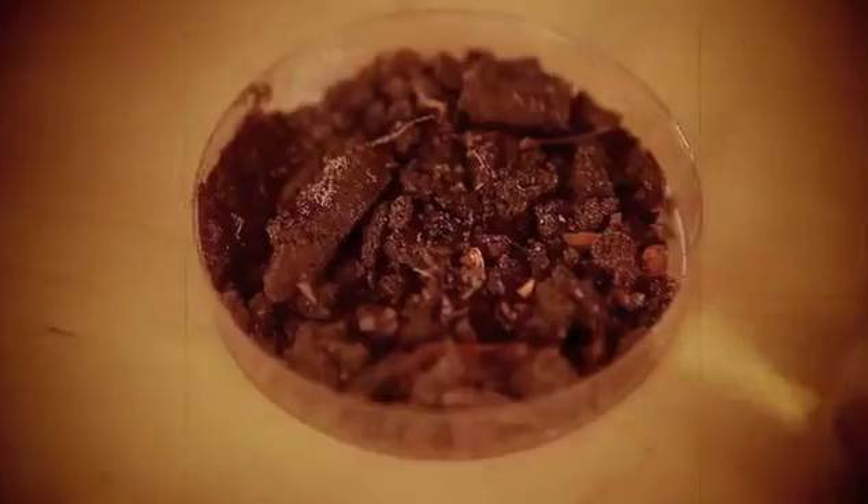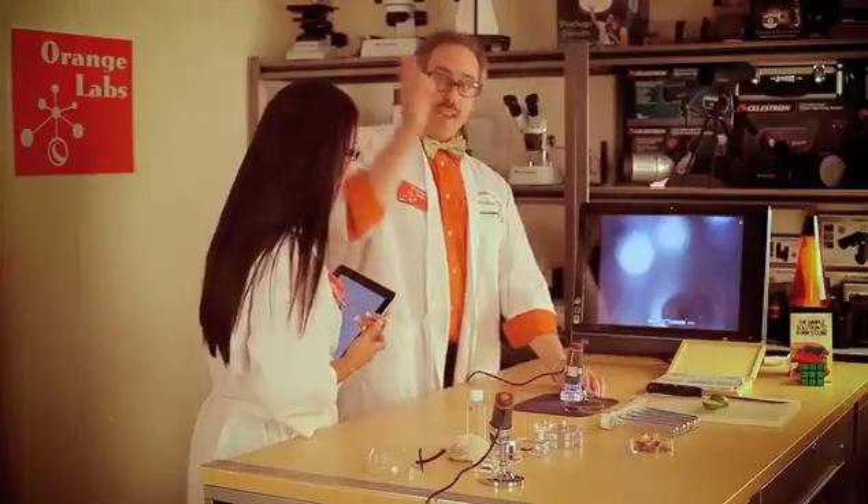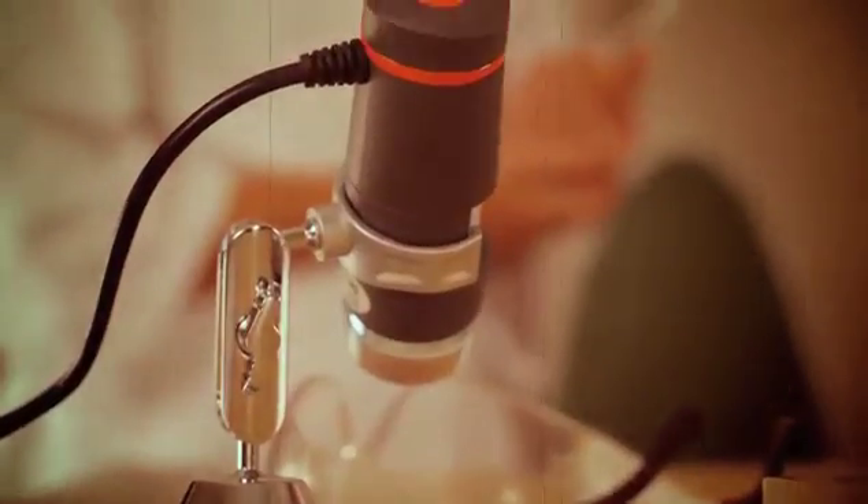You can take pictures of ants, dirt, mushrooms and fungi and all kinds of things. It allows me to take pictures and make measurements. We can even do science. So it's like a webcam that magnifies things? Yes, exactly like that.